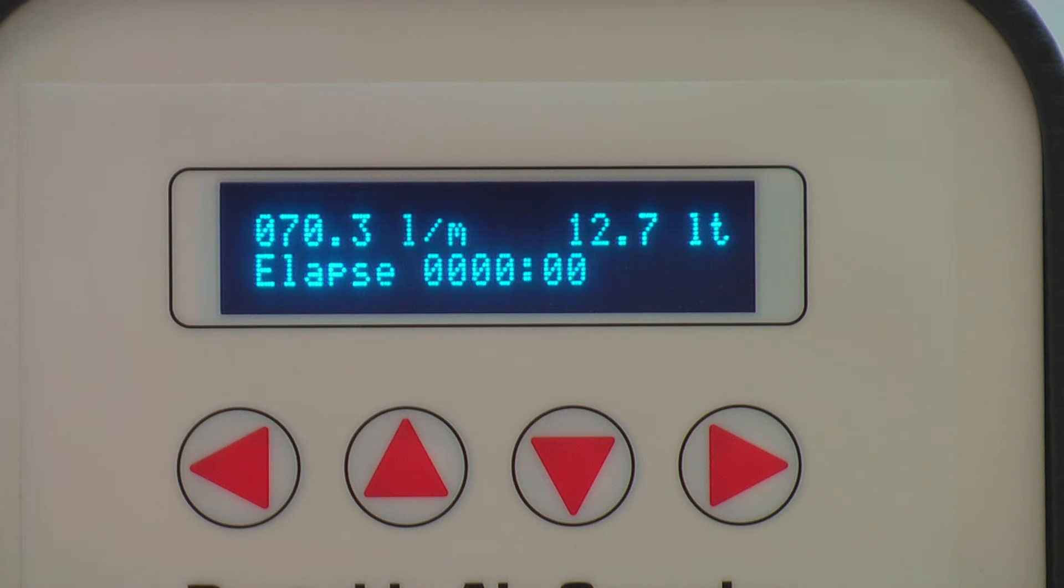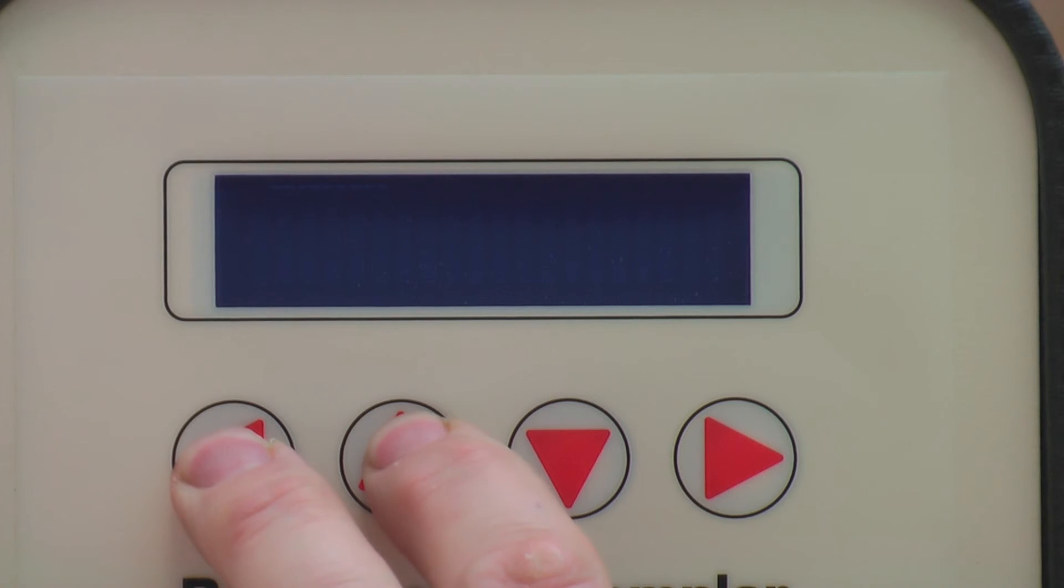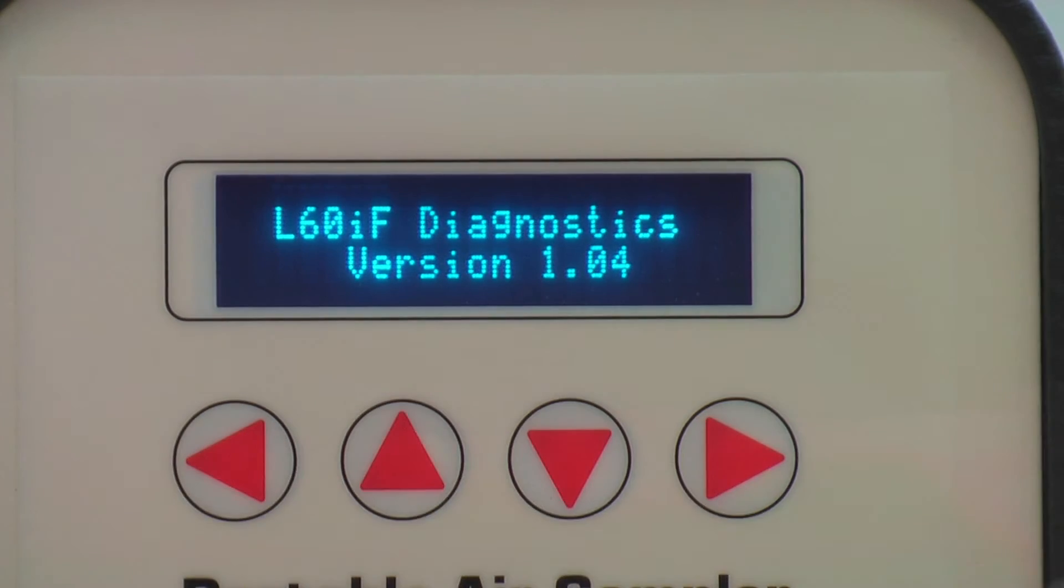The diagnostics menu of the L60IF can be accessed by pressing and holding the left and up arrow buttons whilst turning on the sampler. Continue to hold until the menu appears.